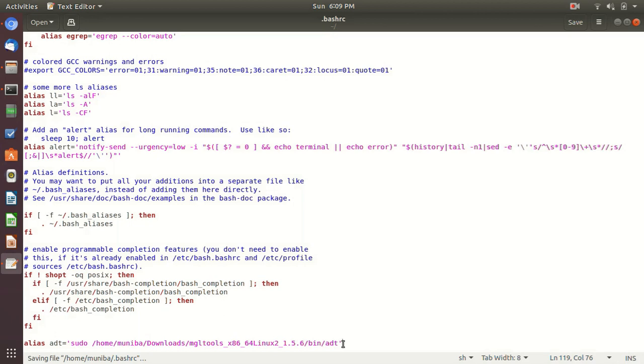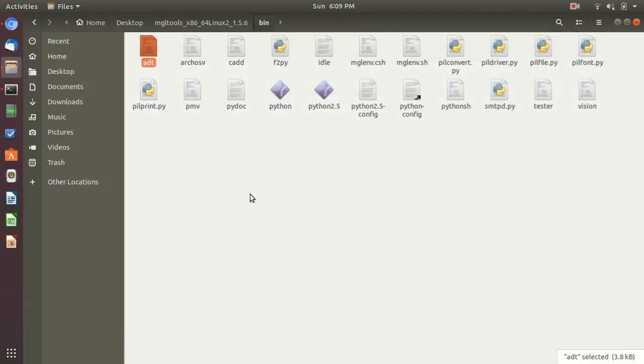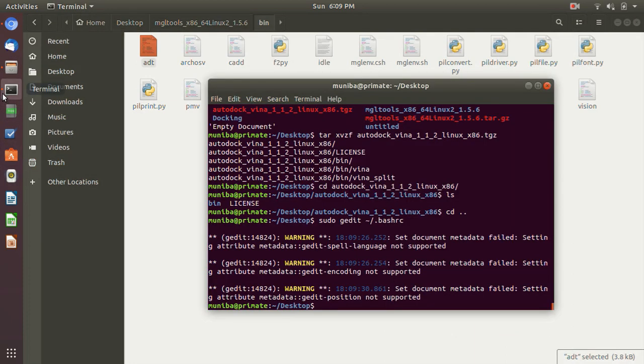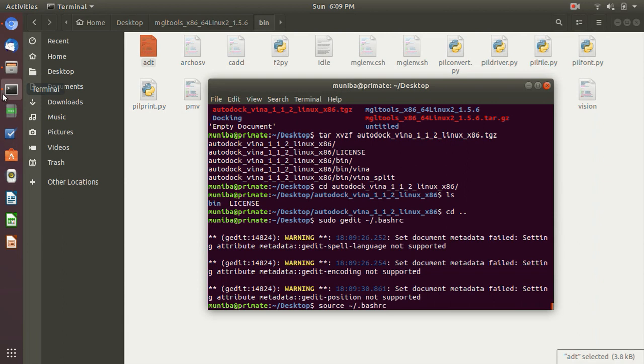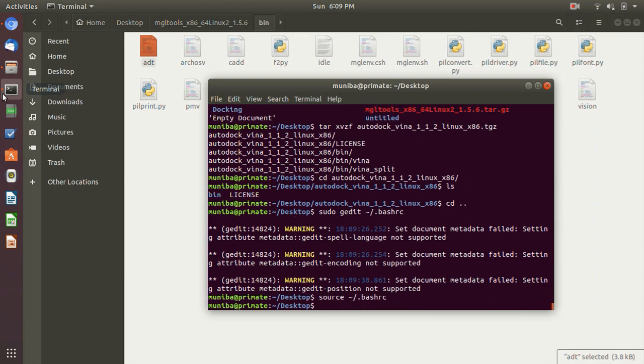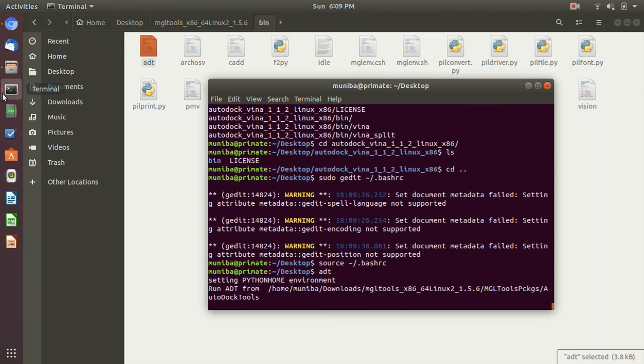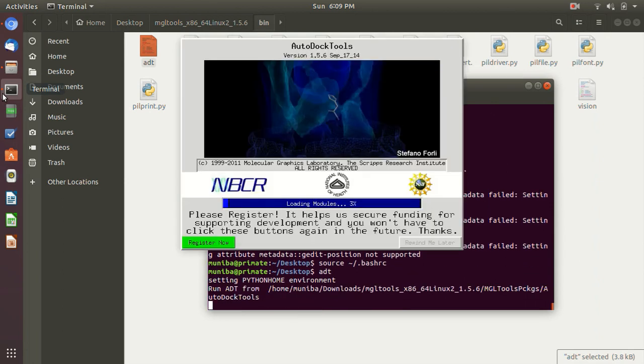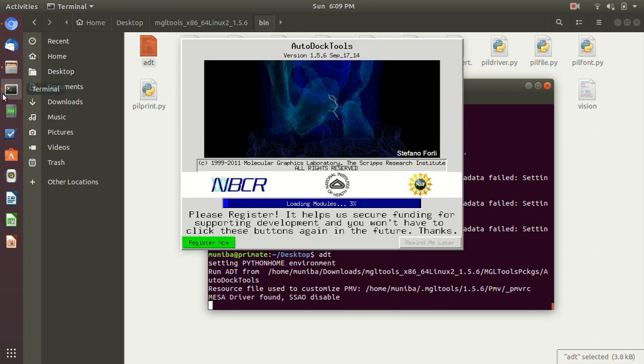Close the single quote, save the file. And then go back to the terminal. Now type source dot slash, sorry, slash dot bash RC file. Okay, and after that, if you type ADT, it will open. Okay.